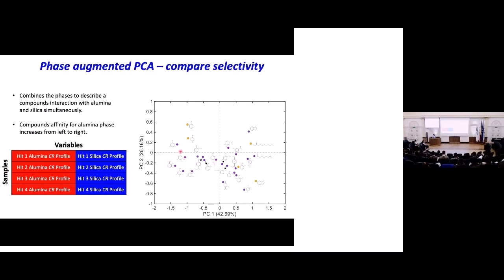And we see that those phenolic compounds tend to be ones where the phenol group is more unhindered by the alkyl groups. An example here being this 2,3-dimethylphenol has very high extraction affinity.